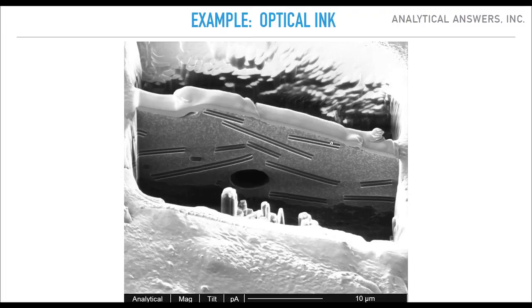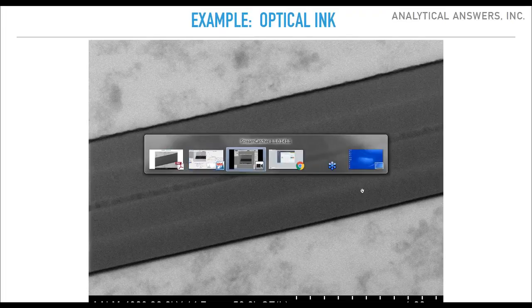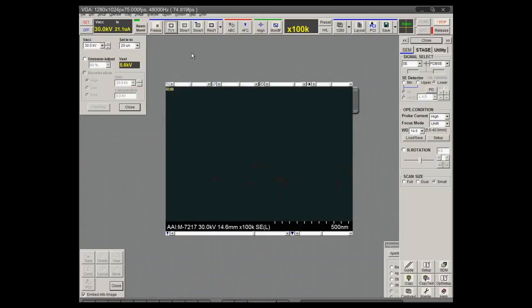Here we have these little crystallites embedded in a polymer matrix. This is, again, a FIB cross-section, focused ion beam cross-section, that was prepared for this webinar. We're going to target a few of these specific crystals to analyze and map. So going through the exact same procedures as with the previous sample, the piece was thinned, then removed and attached to the grid, and then put into the SEM. I do have this sample in the chamber as well.